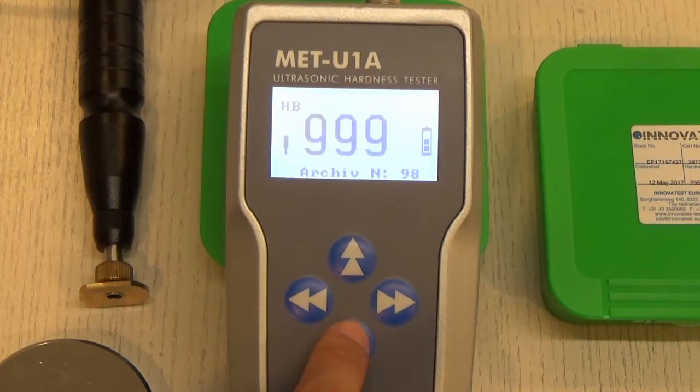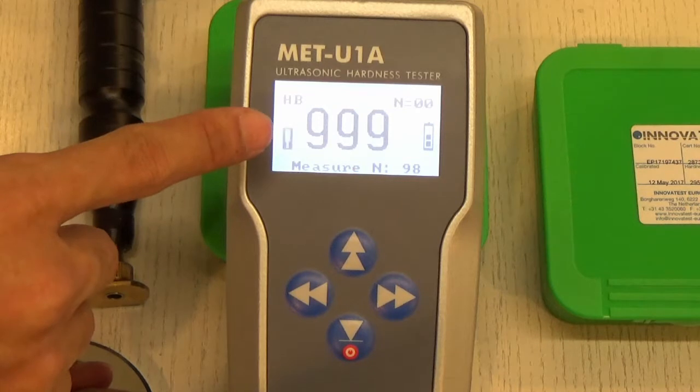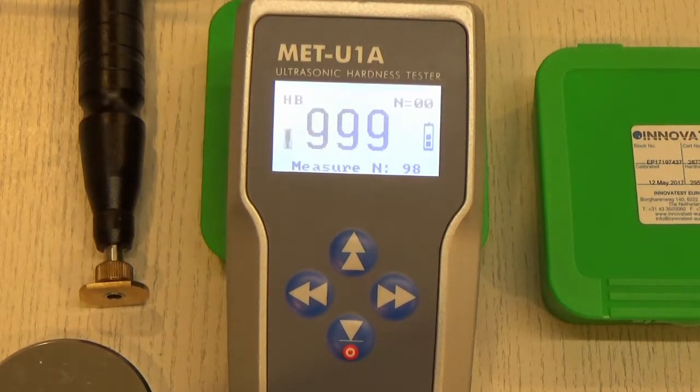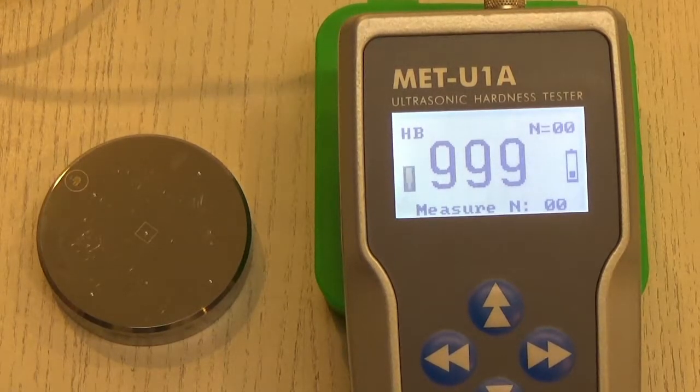After selecting Brinell, press down one more time to go back to the archive screen. To measure, press the down button again to reach the measure interface. You will see a blinking icon showing the probe, indicating it is ready for measurement, as well as the number N for the current measurement count.